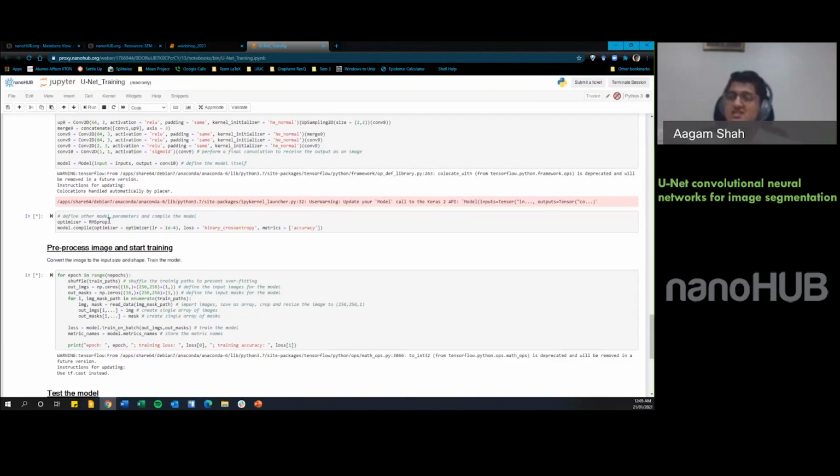These are some things that we like to call hyperparameters, which are parameters that we tune to help our model fit our data better. Ideally, we change these and we try different values for these different options, but we won't really be going into that today.